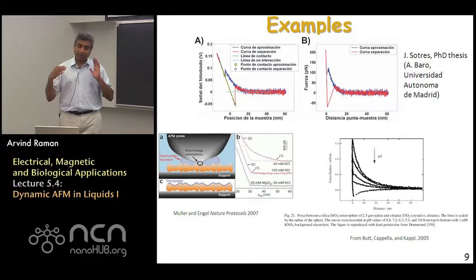And you actually find that as you approach the sample, the cantilever bends up due to repulsive forces, but then snaps in due to the attractive van der Waals forces as you come further in, and there's a snap out corresponding to the van der Waals forces, but then after that it follows the electrostatic repulsion line. And if you convert the FZ curve to FD curves, as you've learned how to do in part 1 of the class, you see a very clear reconstruction of the DLVO forces, which show a repulsive, exponentially growing electrostatic force, followed by a little dip that comes from the van der Waals forces.